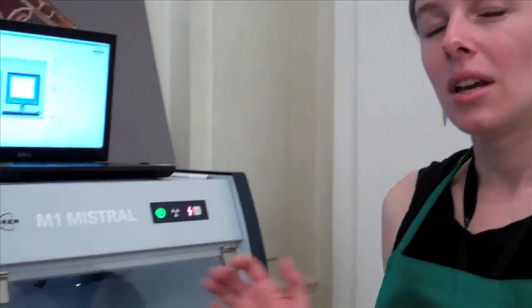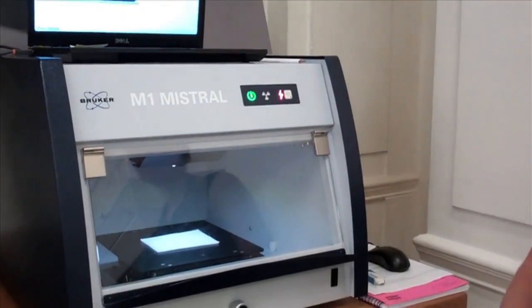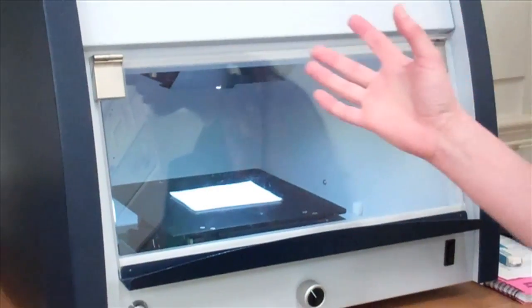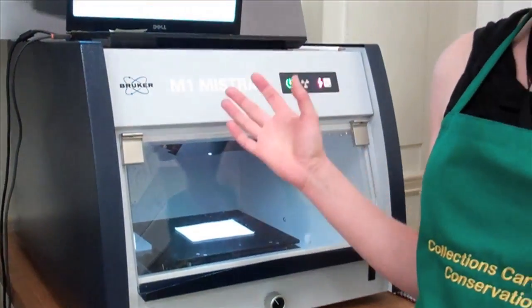So when we use this XRF machine what's happening essentially is that this machine will fire a beam of X-ray radiation at the object that we choose. And on an atomic level what happens is the electrons that are close to the core of the atom are excited and ejected out, and the outer electrons of this atom will compensate for this loss by dropping down to a lower energy level.